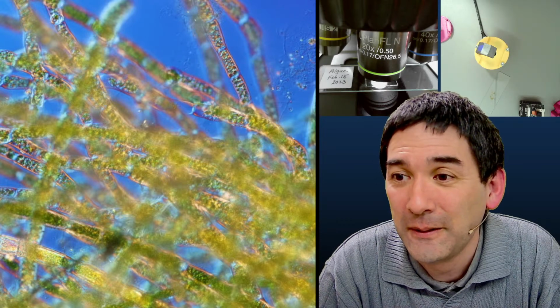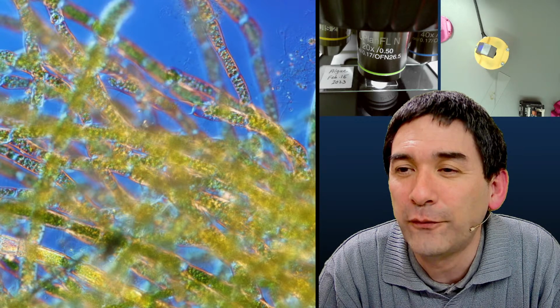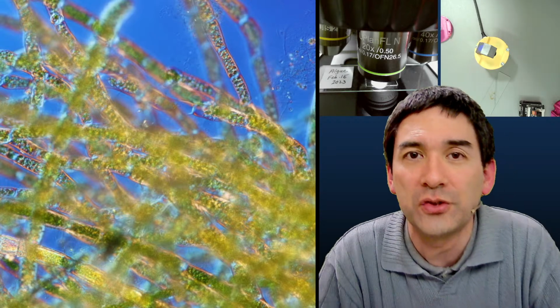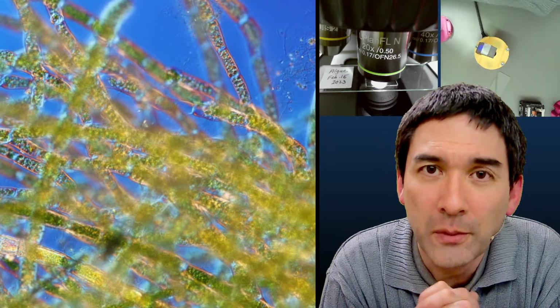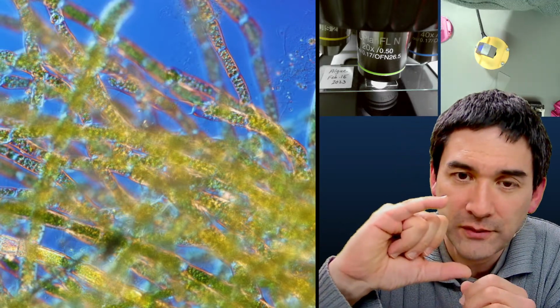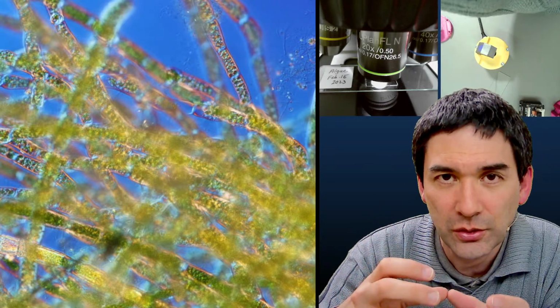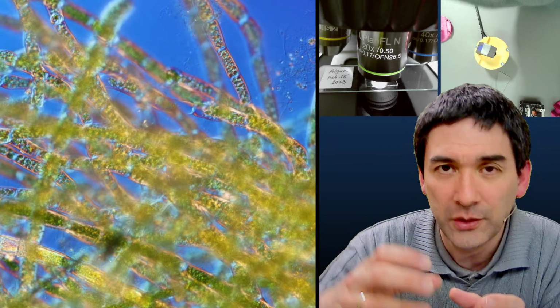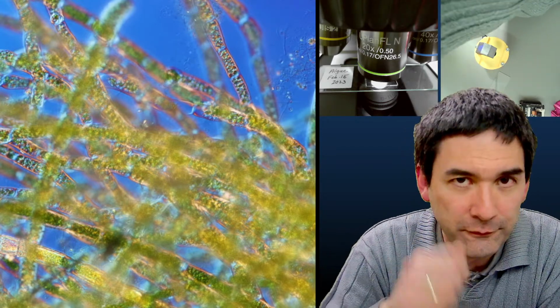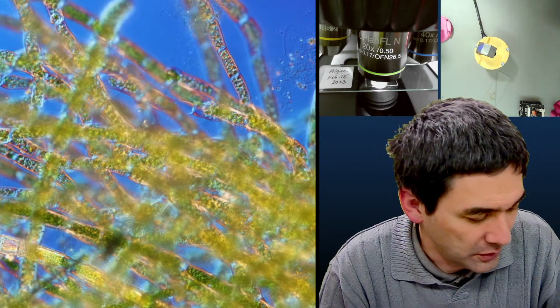Summer is obviously easy to find samples. I cannot wait for mushroom season. It's the first year I have a microscope to look at spores. What do you do if you want to look at spores from a mushroom? You take the cap of the mushroom. So basically you have the stalk and you cut off the stalk and you just take the cap. And what you do is you put the cap on a piece of paper. And then you take something like a knife or fork, and you knock on the cap of the mushroom. I don't know how to demonstrate this.